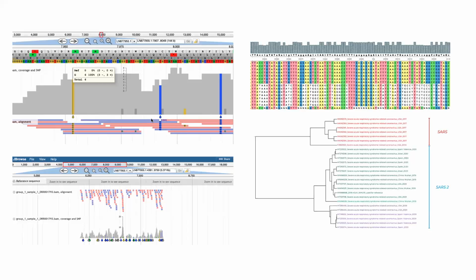After we've identified those variants, or after we have compiled a list of those variants, we can think about how to interpret them. Another approach is when we're not sequencing to study variation in a particular position, but instead looking at how similar or different are different genomes or genes. So here, for example, you can see multiple sequence alignment of genomes, and those genomes help us understand relationships between different groups of samples that we have, called phylogenetic analysis or evolutionary analysis based on multiple sequence analysis.